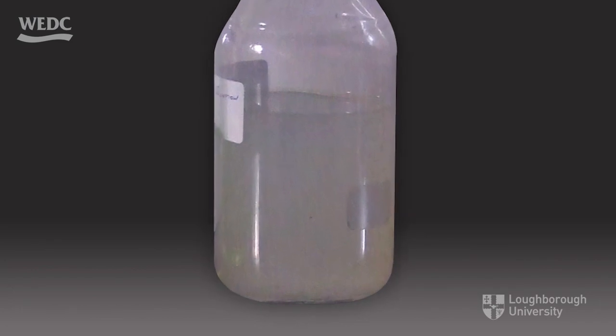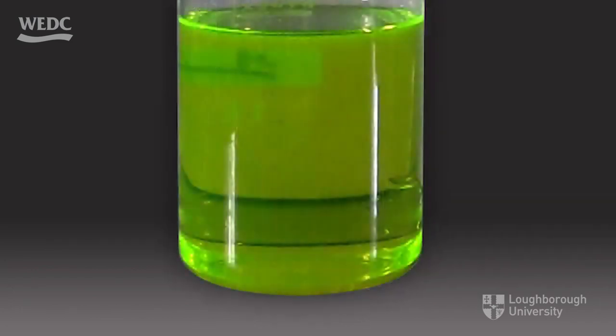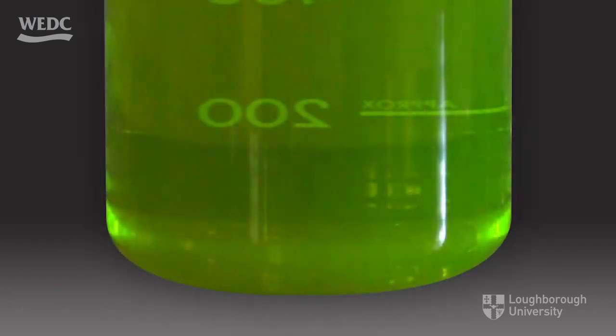Discoloration in water can be caused either by suspended or dissolved materials. Dissolved materials cannot be removed as easily as suspended materials that can be removed by filtration or settlement. If a liquid is a solution, such as this jar containing fluorescein, the light from this laser is not scattered. It passes straight through. We cannot see the beam of light. The solution is coloured, but the colour doesn't scatter the light.